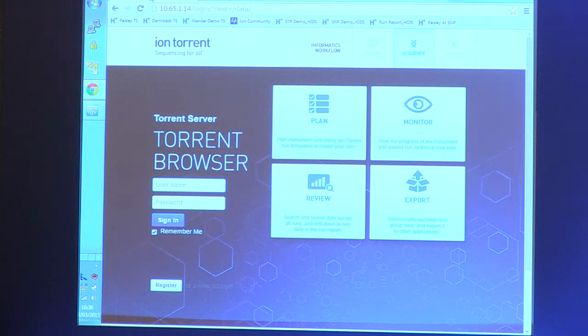However you achieve it, you open the web browser like I have on the screen in front of me, and then you enter the address of your server. It might be very small, but you can maybe see it up the top there. Then you're presented with a login screen, and it looks just like a web page, and you log in.